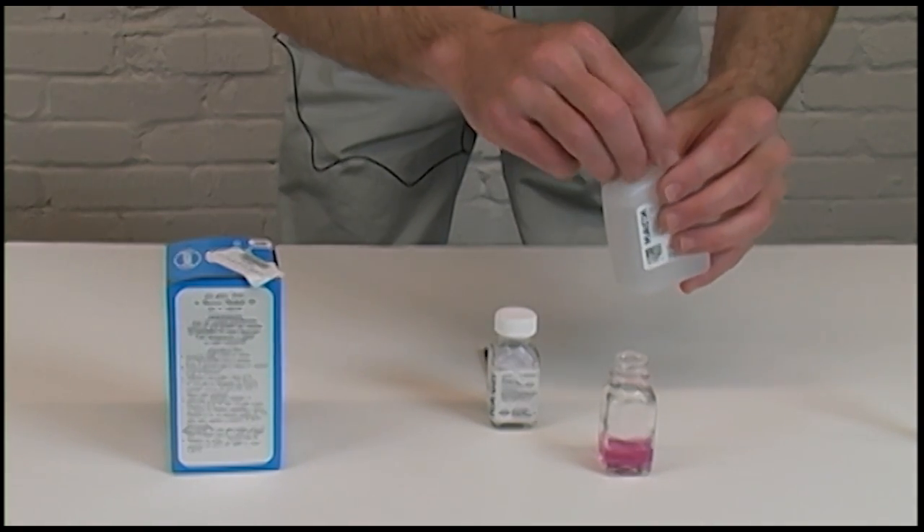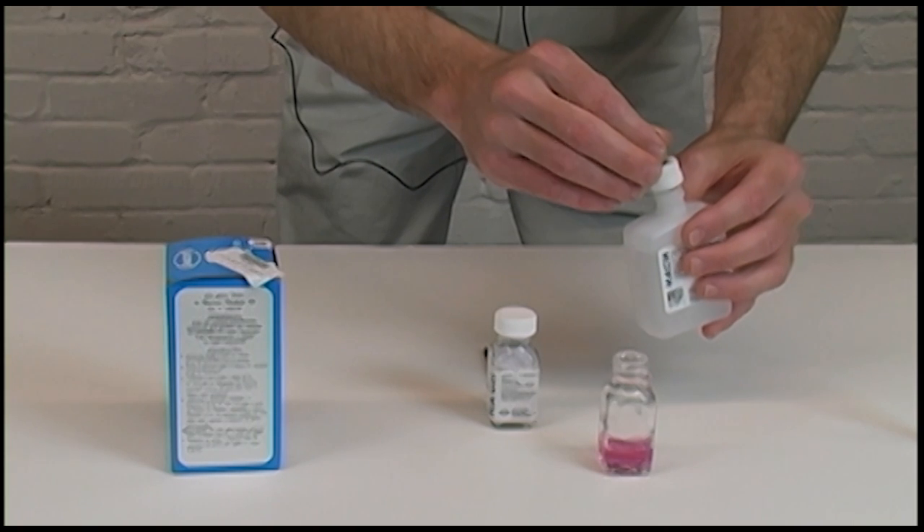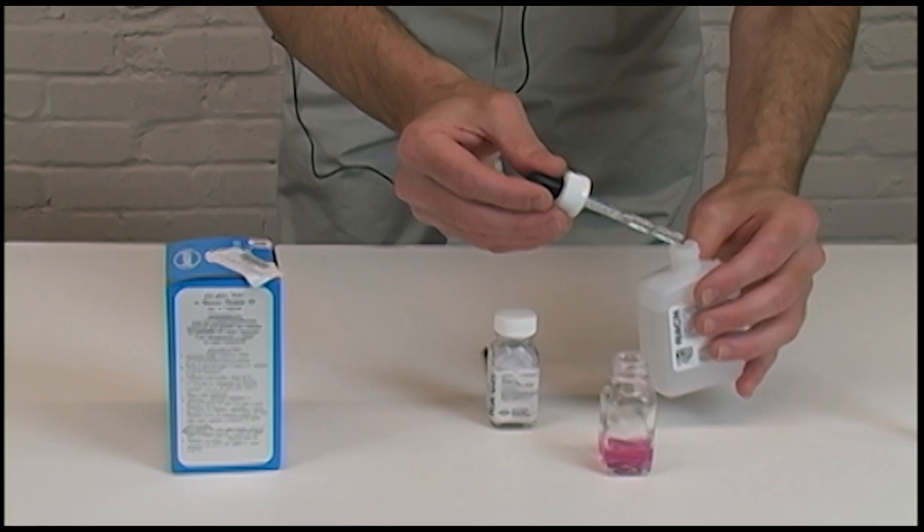Stir it up — you'll notice it will turn a reddish pink color. Then you'll take your titrant solution, and it's very important that you count the number of drops that you're placing in here.